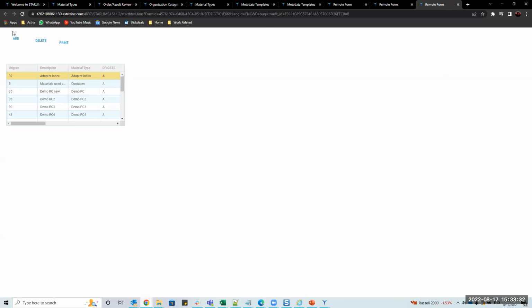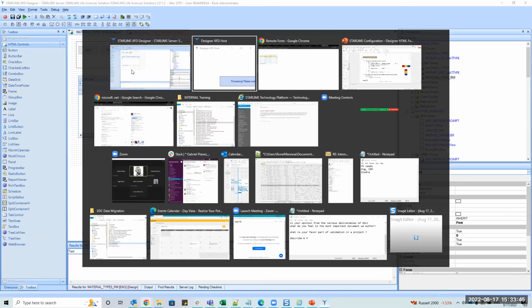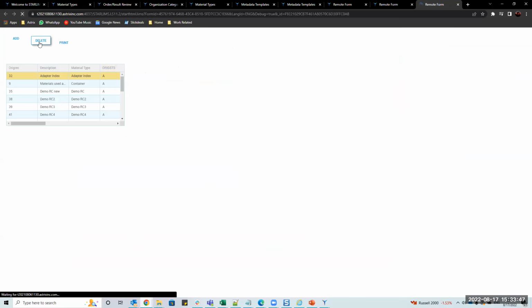Everything is kind of how I put it, things don't expand. I can try to move the buttons up and make them all line up, but if I start changing things around, you quickly lose complete control of this thing. So you have to use relative layouts.